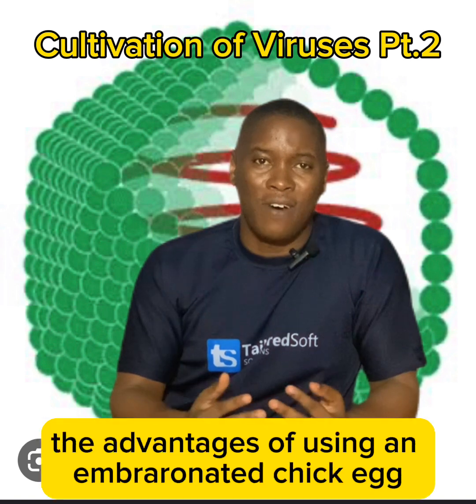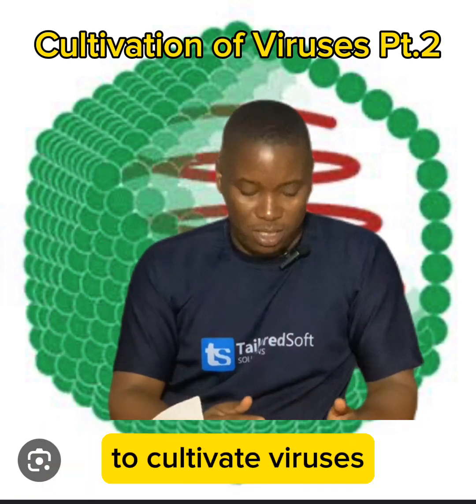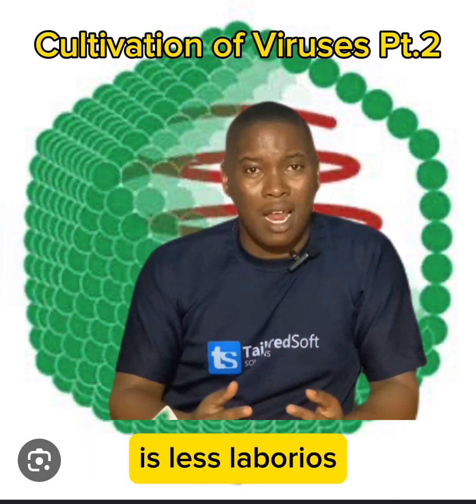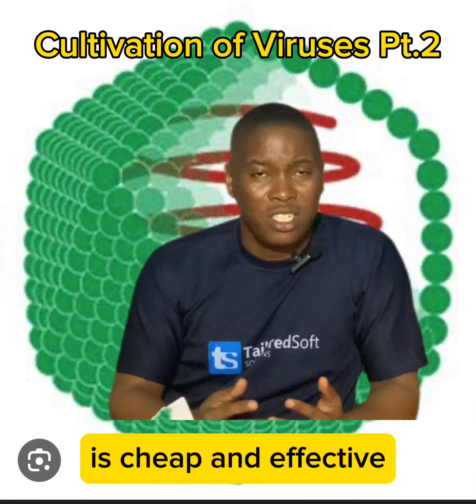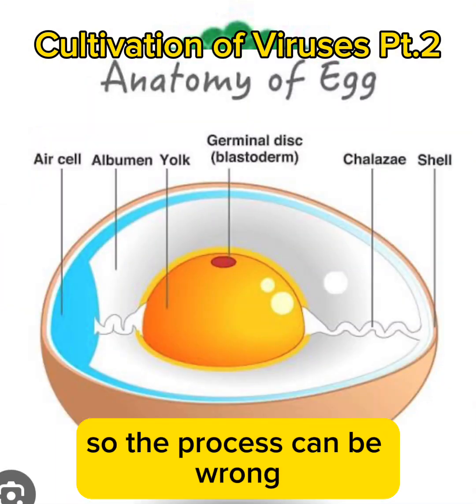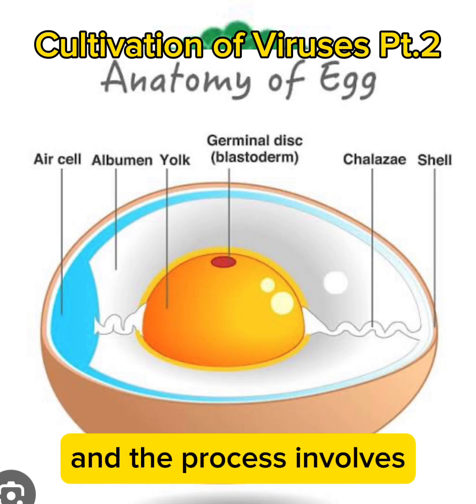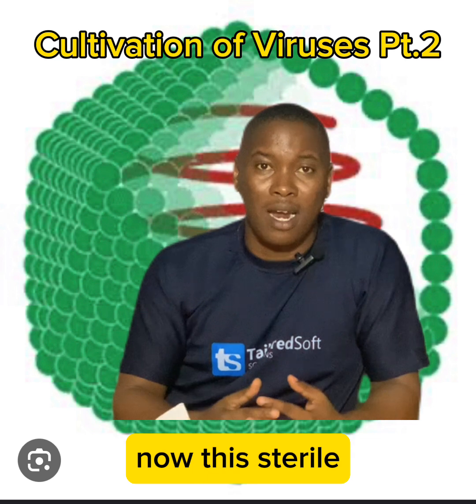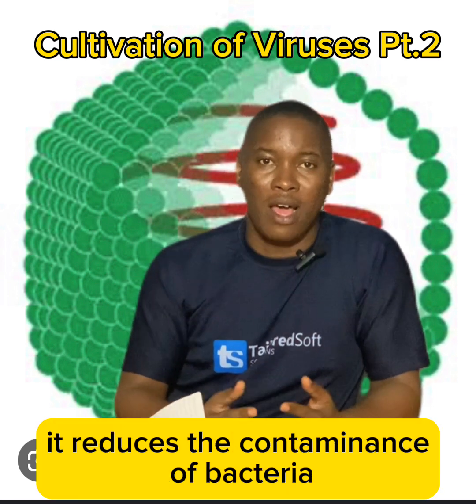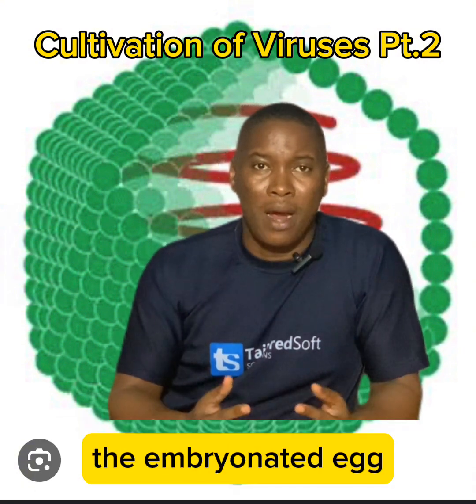Now, what are some of the advantages of using an embryonated chick egg to cultivate viruses? Some of the examples include that it's a widely used method, is less laborious, is easy to do, is cheap and effective, and eggs are readily available. So the process can be run quite easily. Maintenance is easy, and the process involves a sterile process. Now, this sterile process is helpful because it reduces the contaminants of bacteria in the whole process. So these are the advantages of using the embryonated egg.